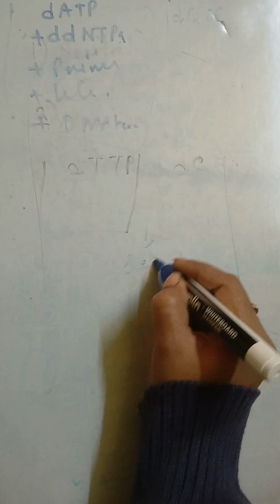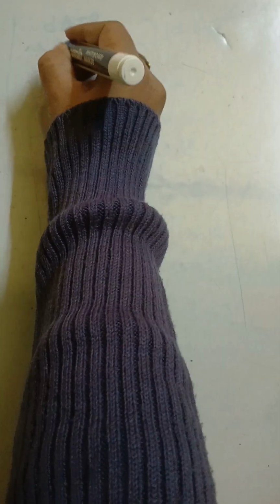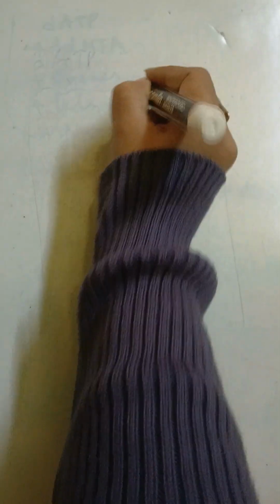and then we will have to run them in a sequencing gel. I'm really sorry, but my markers are not properly working, so please follow my instructions, okay? Suppose the first reaction mix, you will get only dATP containing fragments, okay, that will be dATP containing fragments.